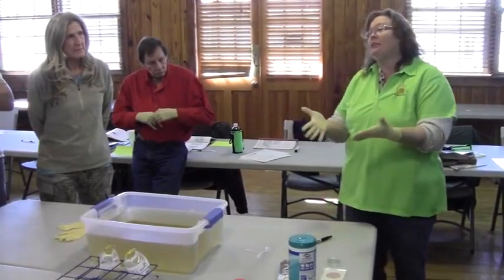And that basically is the protocol. We recommend one blank per day for up to 10 sites. But if there are multiple groups performing the sampling, then you want one blank per group — so up to 10 sites per day. And that blank follows around in your cooler with your other samples, going through the same conditions.